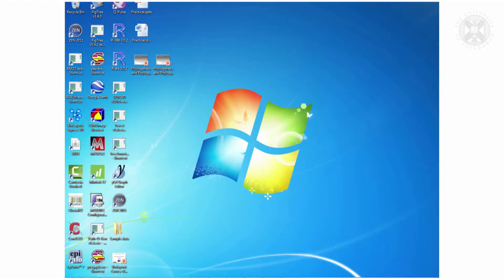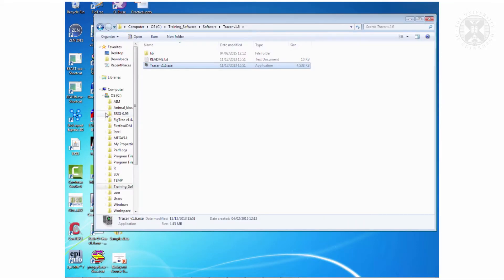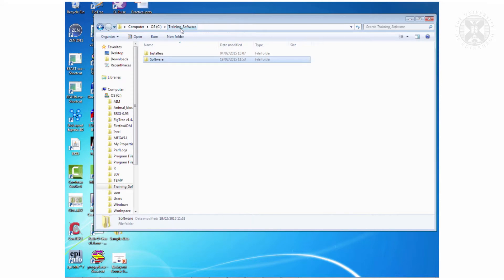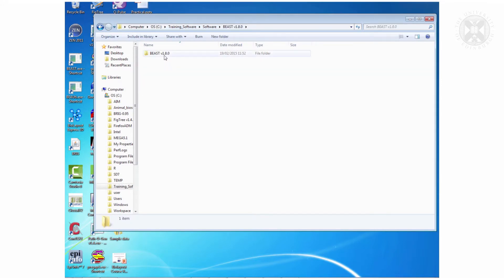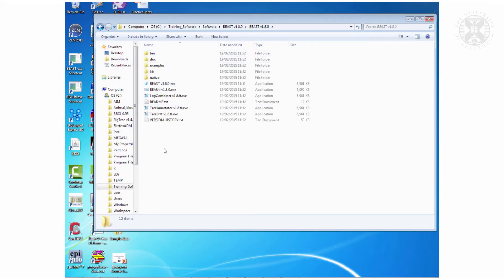Tree Annotator is located at: training software > software > BEAST 1.8.0 > Tree Annotator.